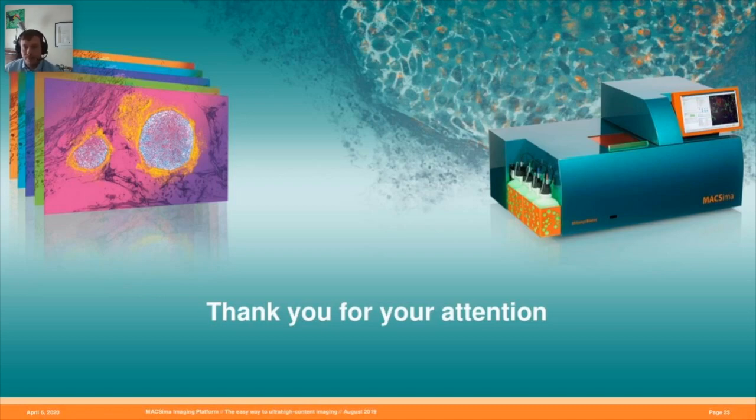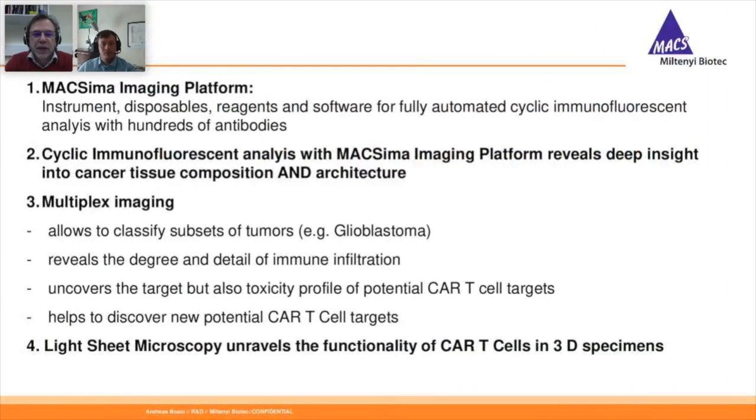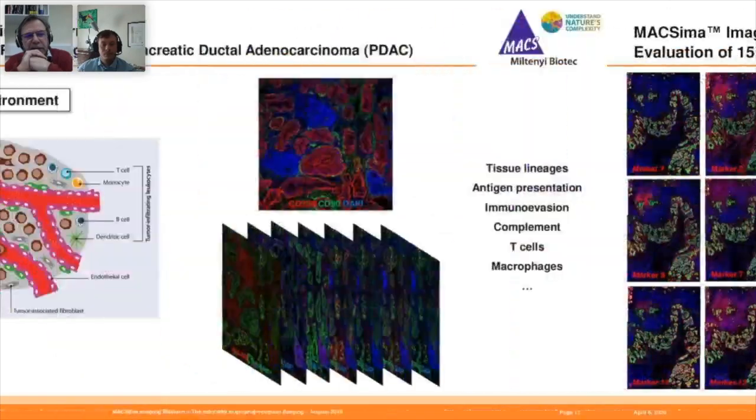Thank you, Simon. One question from me first, just to establish some sort of baseline. You had a slide with more than 100 image channels and 35 cycles. So a typical cycle would be 4 stains?